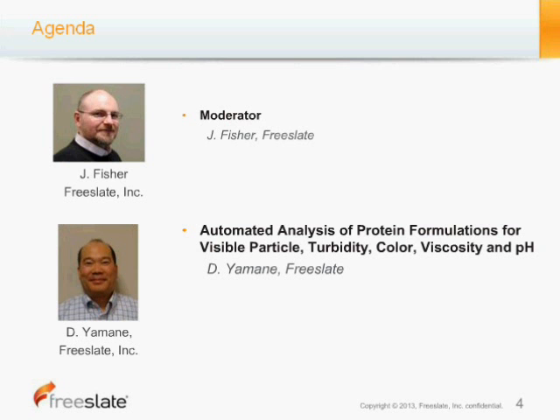The title of Dave's presentation today is Automated Analysis of Protein Formulations for Visible Particle, Turbidity, Color, Viscosity, and pH.